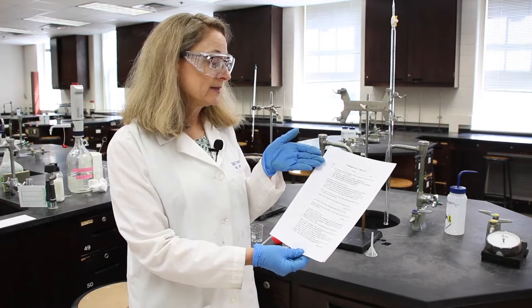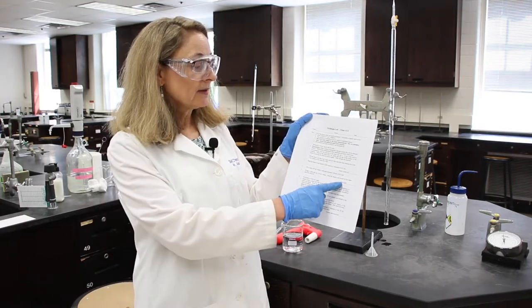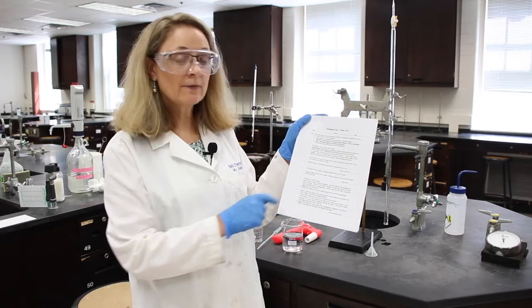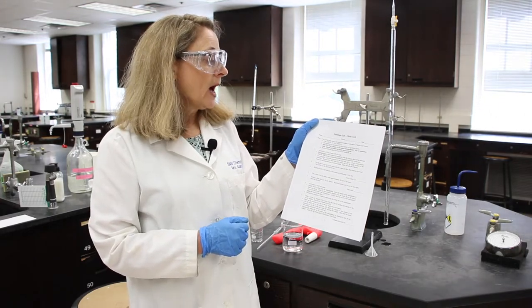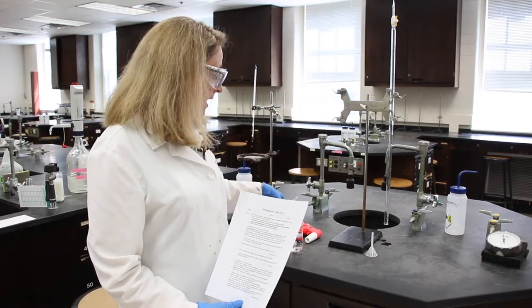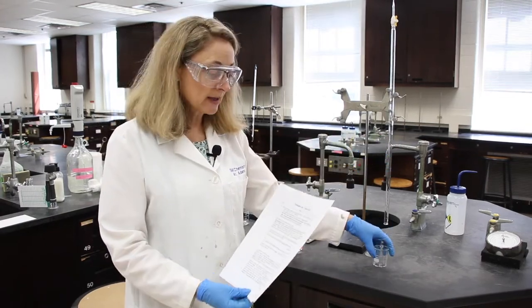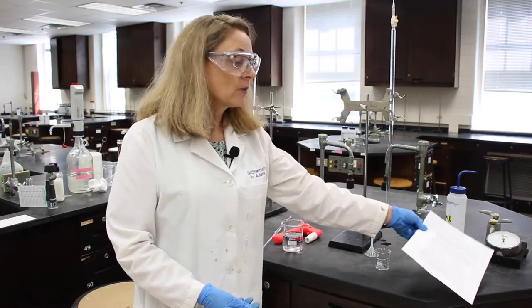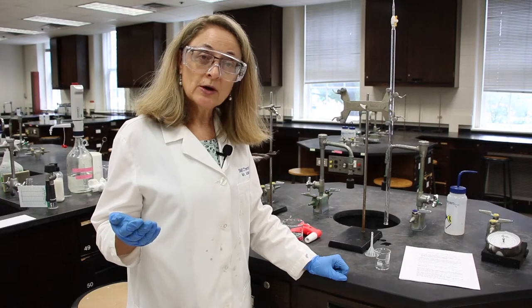There are a couple of things that I'd like to highlight. Please use units at all times. The numbers in the parentheses, such as two or three or four, are the number of significant figures that your value should be recorded to. Please note that burette readings and pipette readings are very accurate — do not go by the readings on the beaker, as these are just generalized markings put on at the factory. We are going to record both the burette and the pipette to the hundredth of the milliliter. If you need to review how to read those pieces of equipment, there is a video about that.